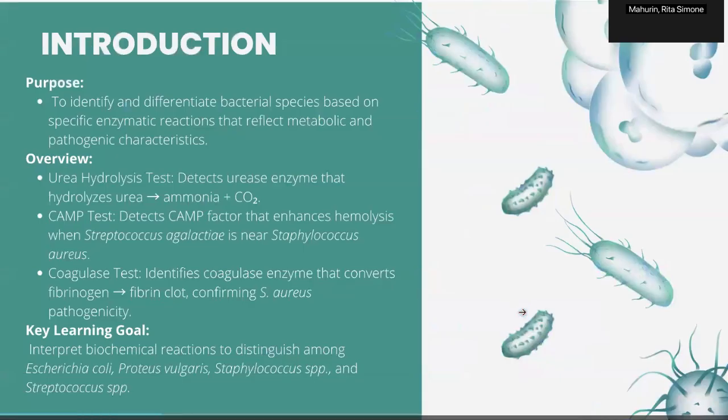In the introduction, we highlighted the purpose of this lab, which was to identify and differentiate bacterial species based on specific enzymatic reactions that reflected their metabolic and pathogenic characteristics.